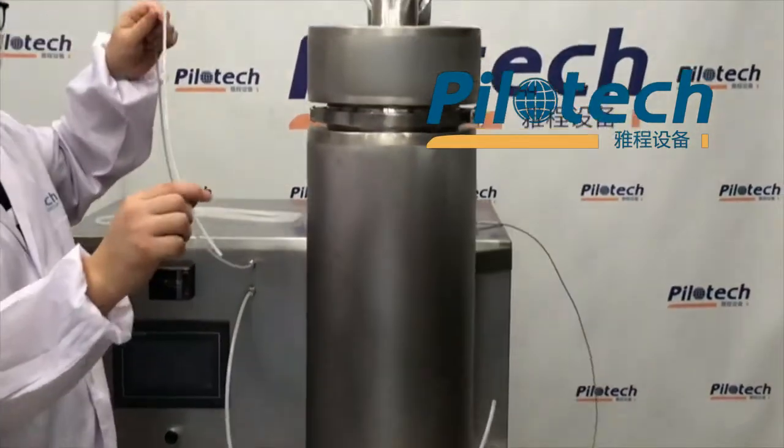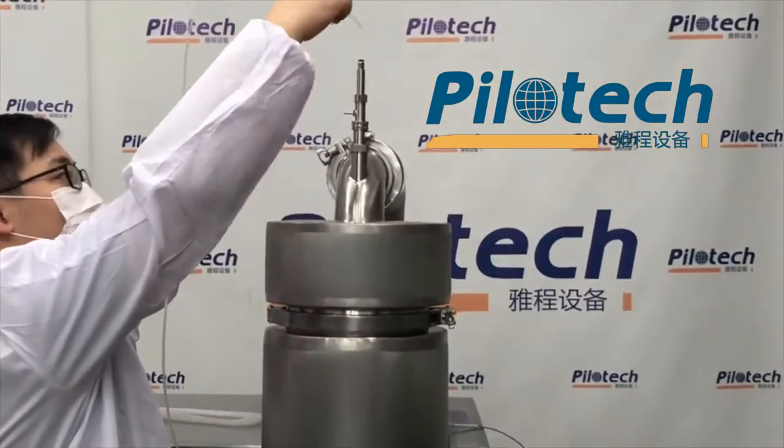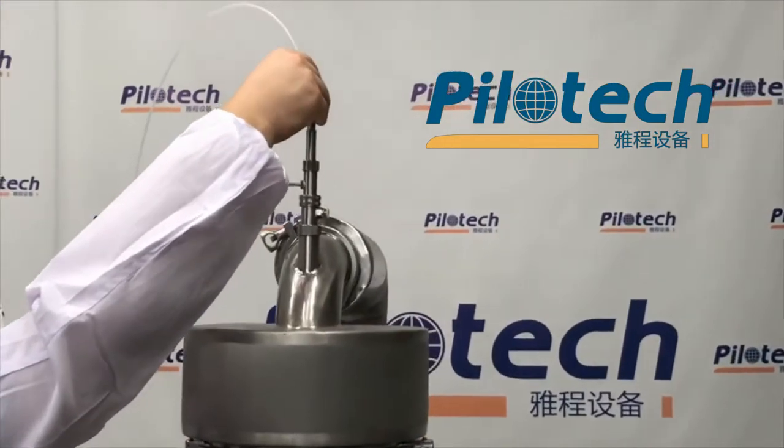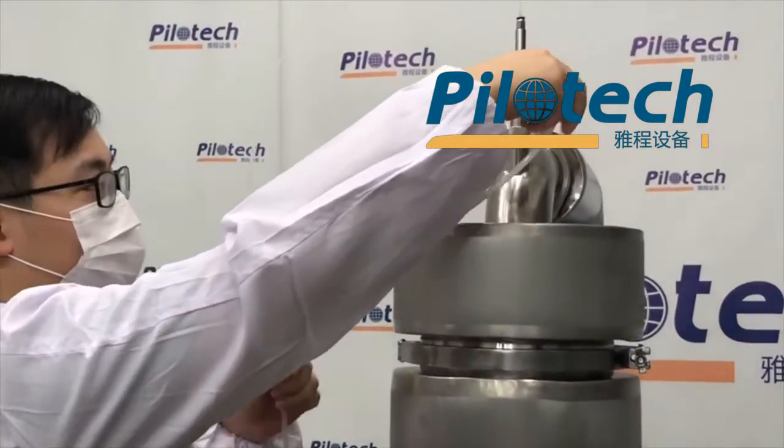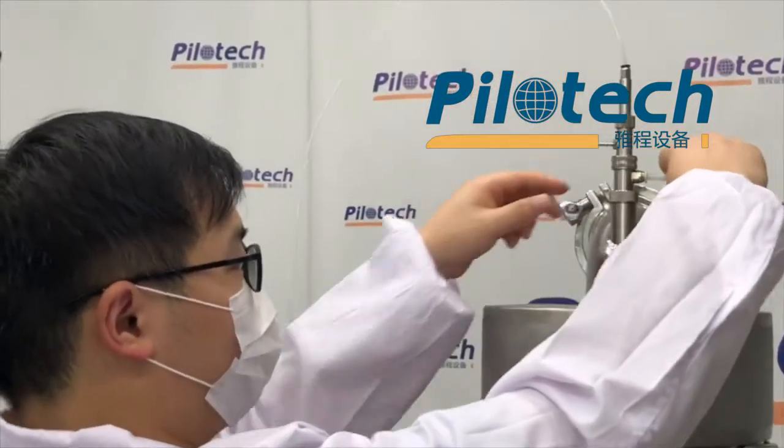Now, install the needle tube on the top of the atomizer. This one is the compressed air tube, inserted on the right of the atomizer.